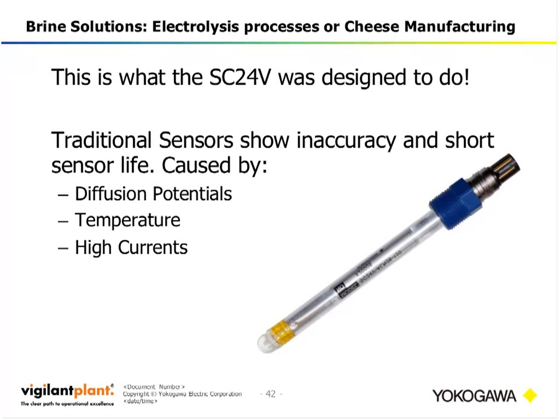So evidently these problems are not related to the pH measuring cell, but almost exclusively to the reference side. Therefore the solution of the problem must be sought in alternative ways of generating a reference voltage that is stable over time and independent of the pH value, thus resulting in the creation of the sodium reference element.